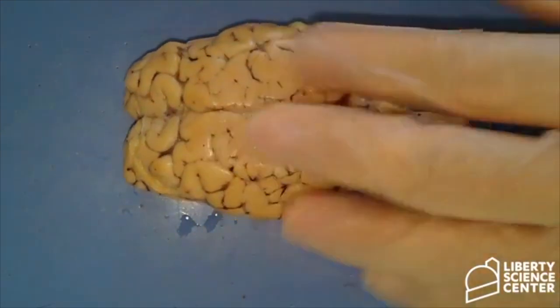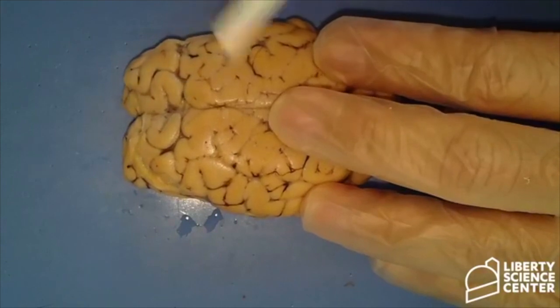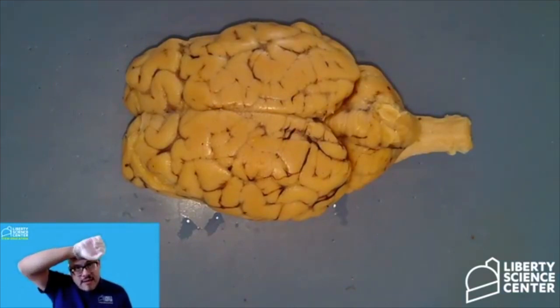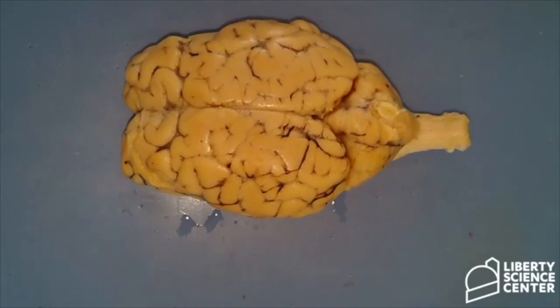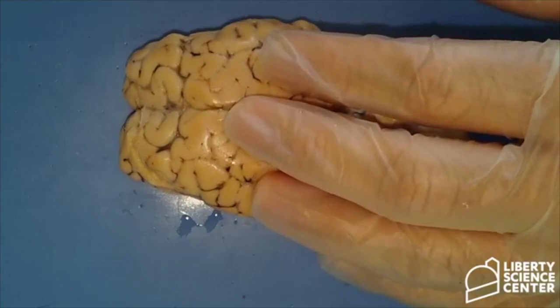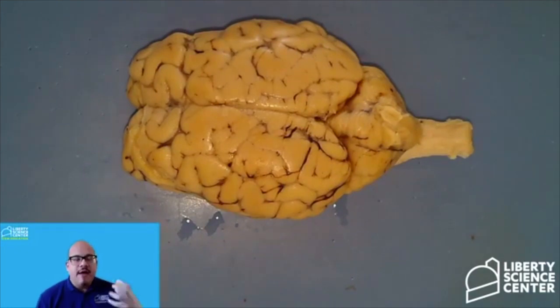Now, the first lobe we will see is the frontal lobe. The frontal lobe is this area right here at the very top in the anterior. If I were to touch my forehead, that's where the frontal lobe is located. The frontal lobe controls all cognitive processes, meaning executive decisions. This is the center for planning and understanding your morals, what's a good idea, what's a bad idea, planning before you start making a move. That is where all of that process happens.